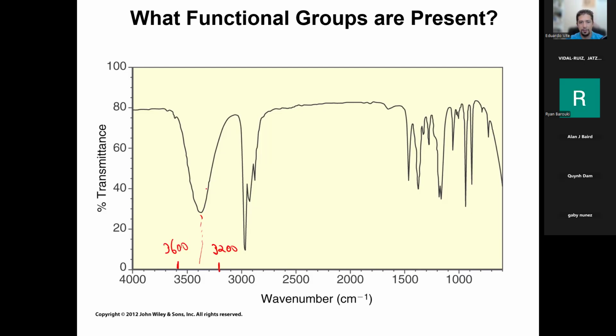So this is a broad signal, strong signal. This is your hydroxyl signal. This is your OH alcohol signal, right? You can say alcohol instead of hydroxyl if that benefits as well. Just give me a name. You have to practice the language. And then at 3,000, you have the sharp peaks for sp3 carbon hydrogen stretches. We assume they're sp3s because we don't have any other structural information.